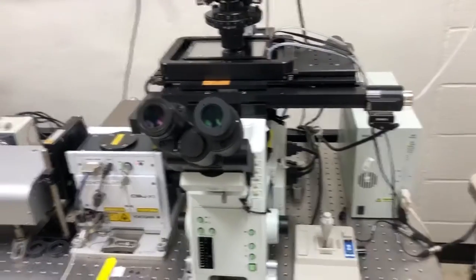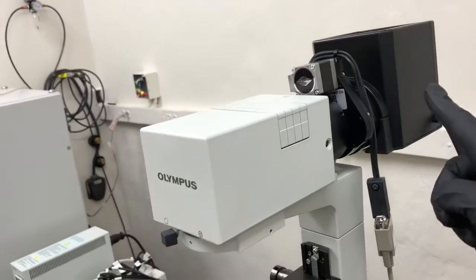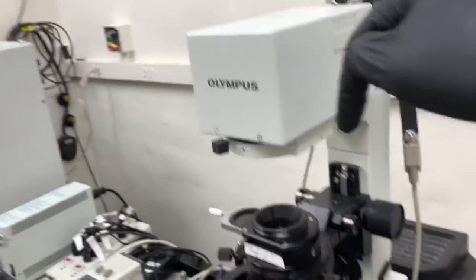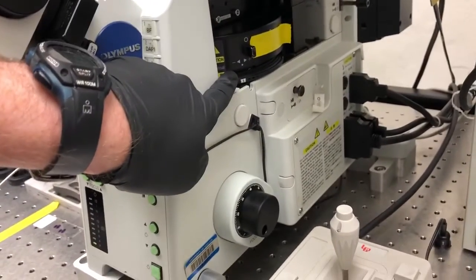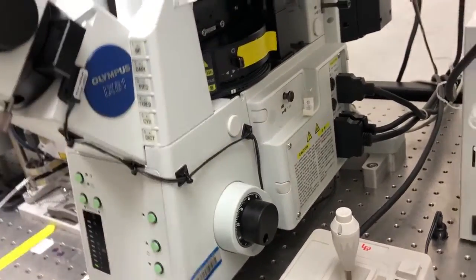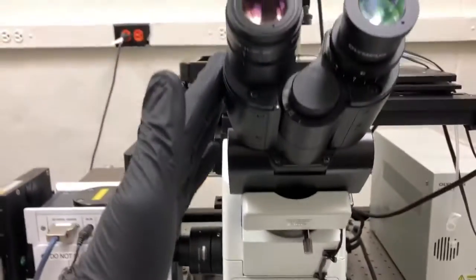So on the microscope, the brightfield illumination comes from this lamp here, goes through here, down through the condenser, into the sample, through a filter cube down here. And then the light can go either to the camera ports on the left or to the eyepieces here.